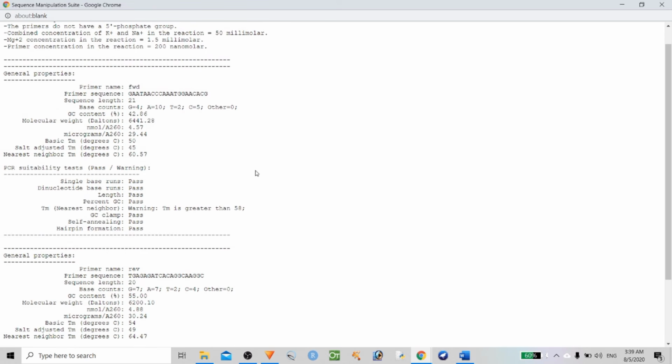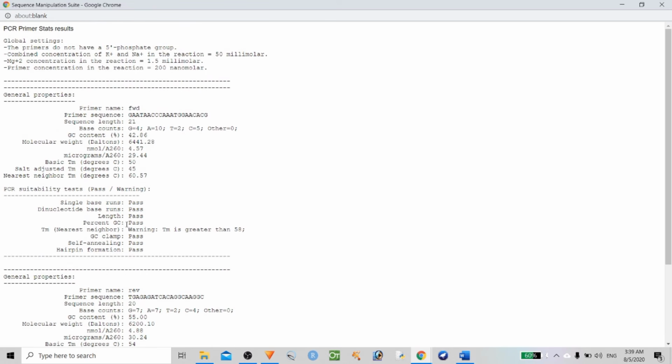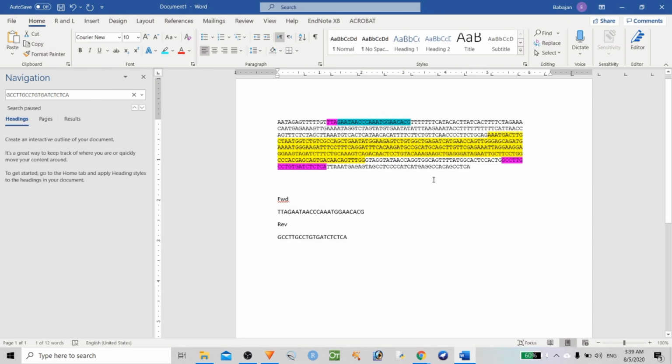Now we can see the GC content has been covered. Now the GC percentage is very good for us. So like this, you sometimes have to use manual curation to get a very good primer. And you always need to be very cautious when you are adding or shifting the frame. You cannot delete residues in the middle of your primer. You always have to delete in the 5' region or the 3' region if you want to extend or shorten the base pairs. Okay, you can do it.